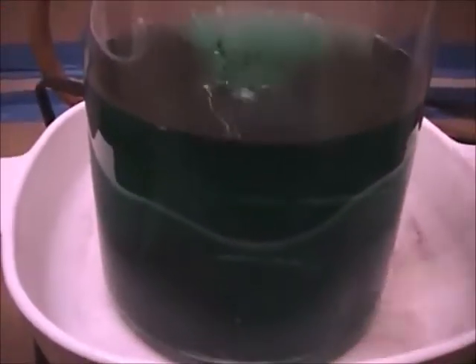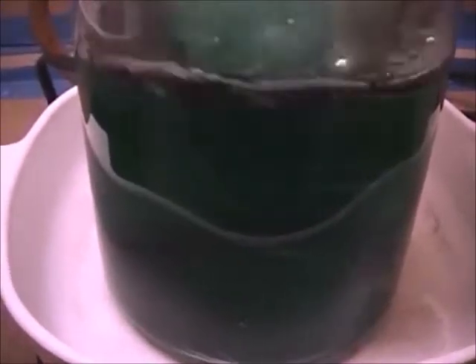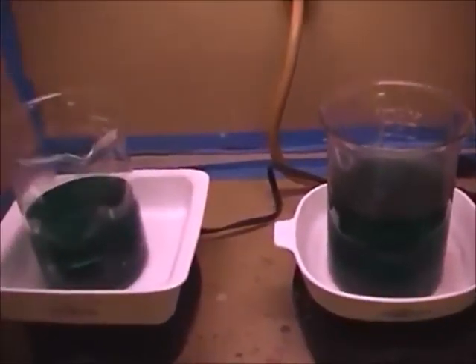And we're going to take some of our sodium formate here, and we're going to see what happens. Interesting. In case you didn't notice, it turned black as it hit the bottom. Alrighty. Let's add some more. Alrighty. I'm going to let that set for a minute and cut away, and we'll give that just a few minutes and come back to it.